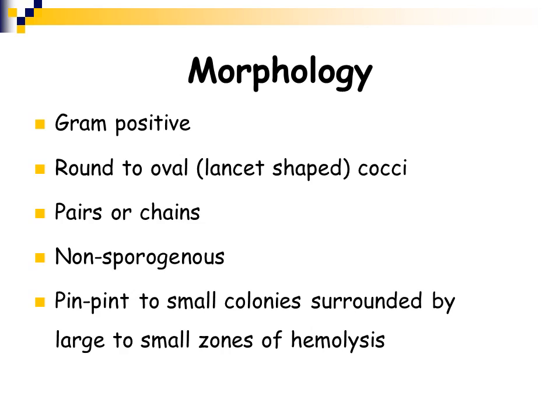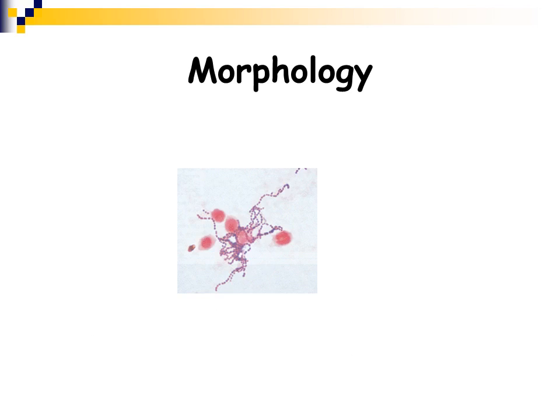These are non-spore forming organisms. These are very teeny tiny organisms. So if you have a staph and a strep on the same blood agar plate, the strep colonies on the plate tend to be much tinier than staphylococcus colonies. You always have to look very carefully for any type of hemolysis in your Streptococcus organisms on sheep blood agar. Here's your nice chaining of your Streptococcus organisms.